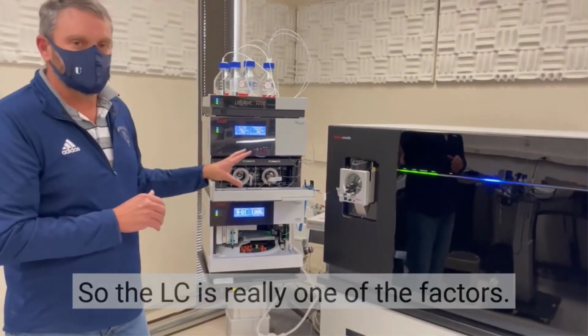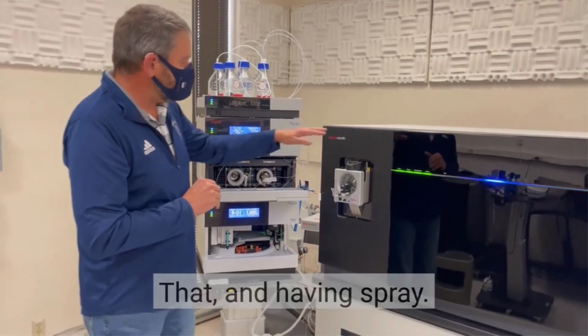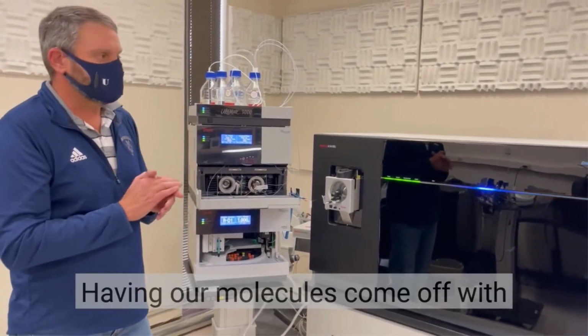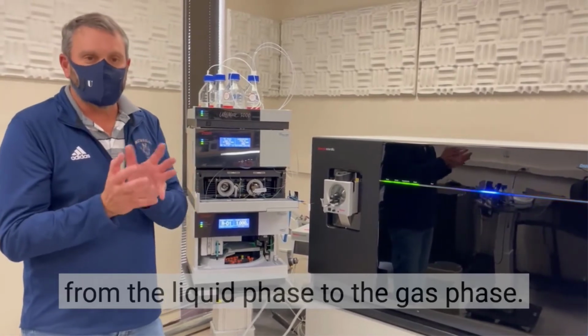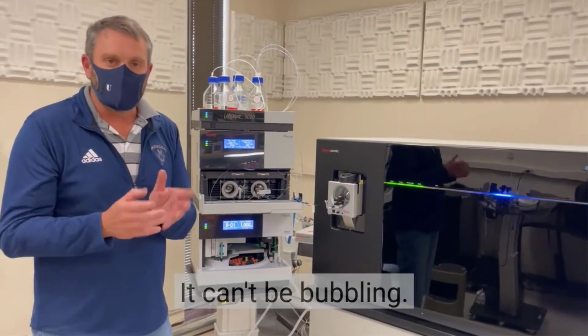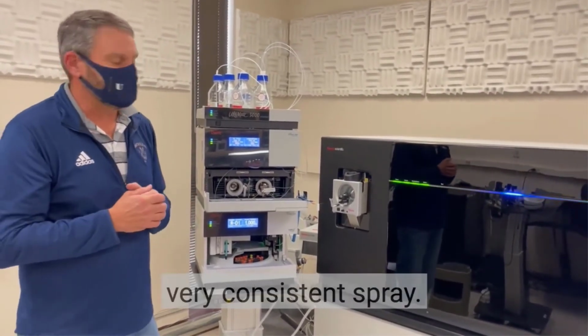So the LC is really one of the factors, that and having a good spray. Having our molecules come out with a nice steady spray, going from the liquid phase to the gas phase, has to be very consistent. It can't be bubbling, it can't be sputtering in any way. So that has to be a very consistent spray.